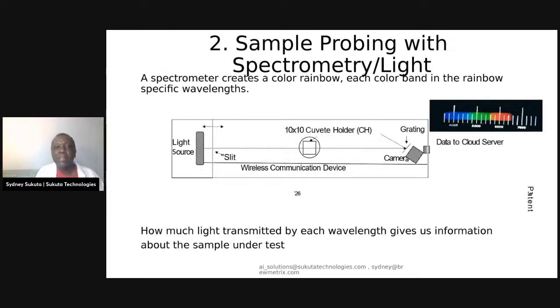Okay, so let's discuss spectrometry a little bit. We keep talking about spectrometer and AI. So the first thing you need to do is to shine light through the sample, and that will gather information about the sample at a molecular level. And then once that data is available, it goes to AI. But let's take a closer look at this.